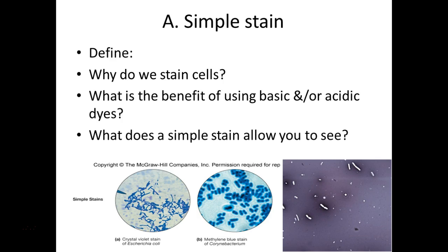These dyes have a charge to them, right? Basic dyes have a positive charge. Acidic dyes have a negative charge. So notice that these crystal violet and methylene blue are staining the cells, right? These are basic dyes. They're positively charged. What do we know about charges? What's attracted to what?